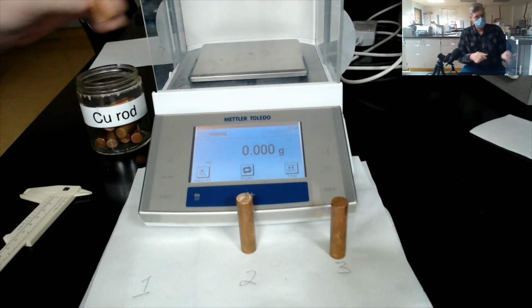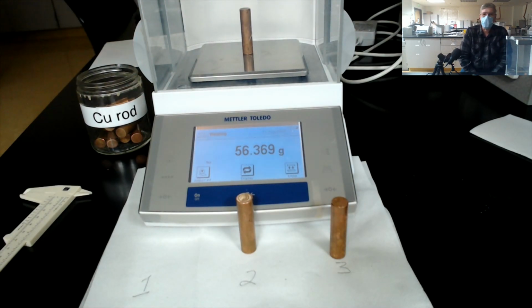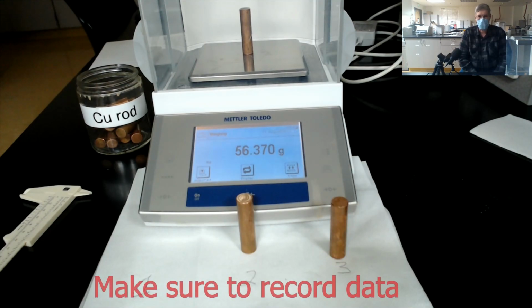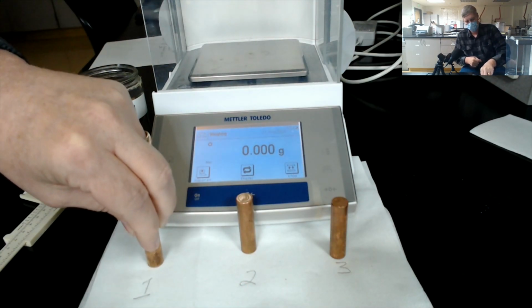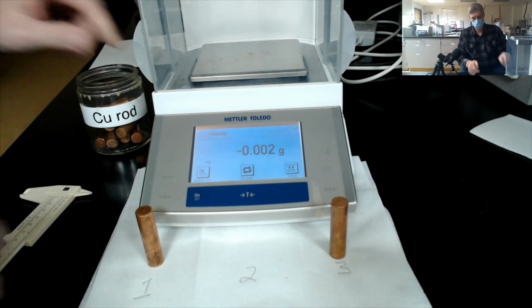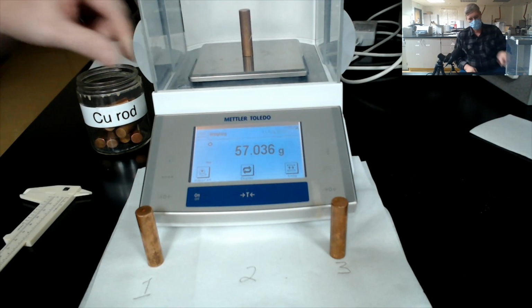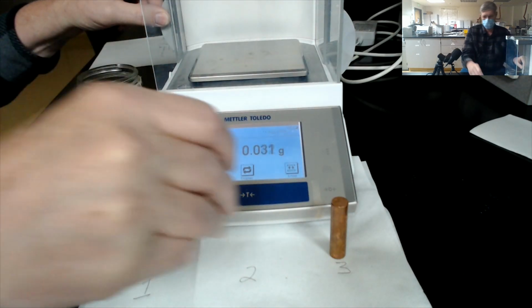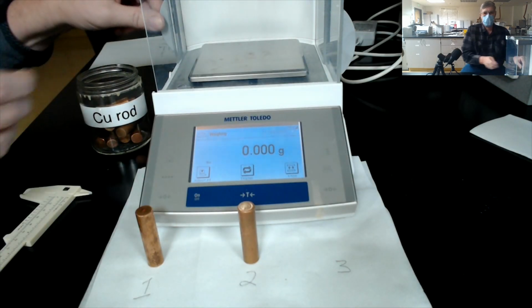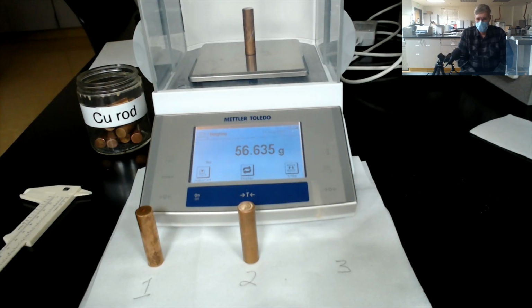So to record the mass, we gently place the cylinder on the pan. We wait for the number to stop and record this in our notebook. So your first mass of rod 1 should be as shown on display. We will do the same thing with rod 2 now. Just double check our 0. Place rod 2 on the scale. Okay, record the mass for rod number 2. And then we'll do this for rod number 3. Okay, record the mass for rod number 3.